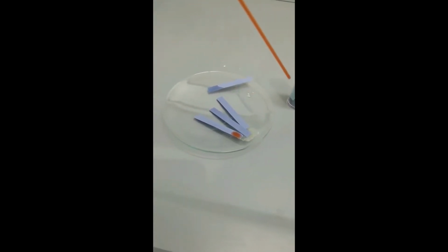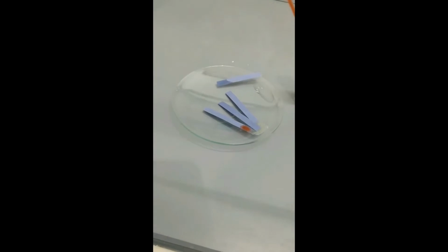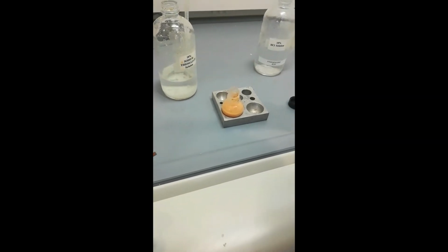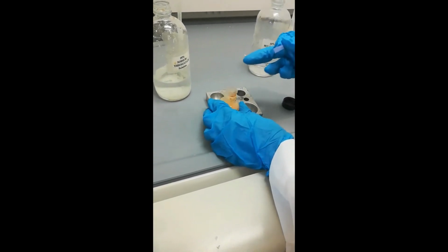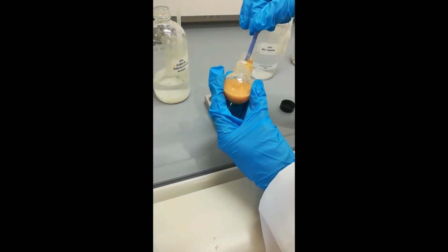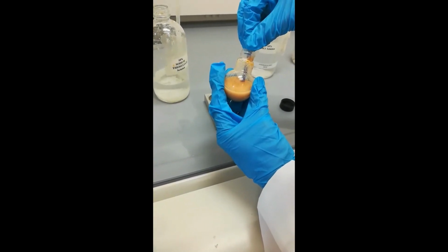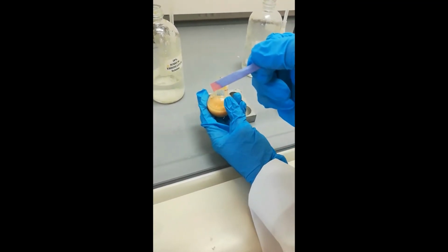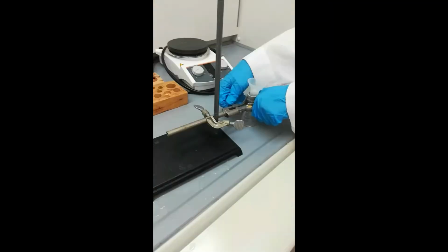Still no significant pink color. That means more addition of hydrochloric acid. Then after more addition of hydrochloric acid, the solution right now is pretty muddy, and then we'll check again. This time the litmus paper dipped in the solution comes out pink, which means the solution is acidic.